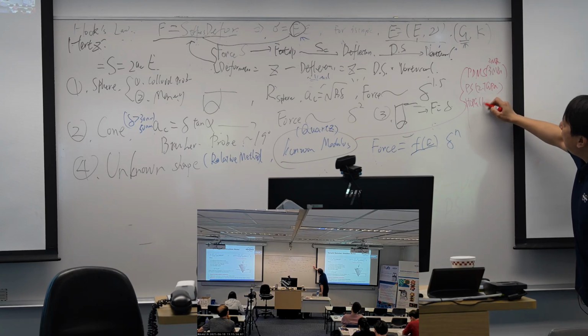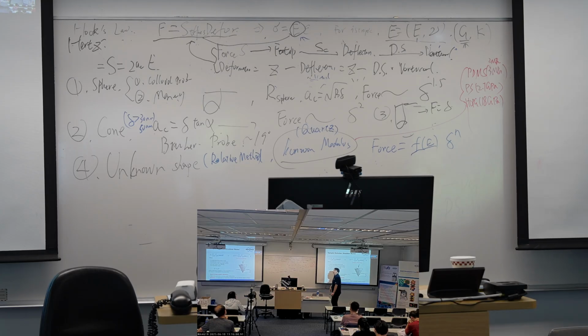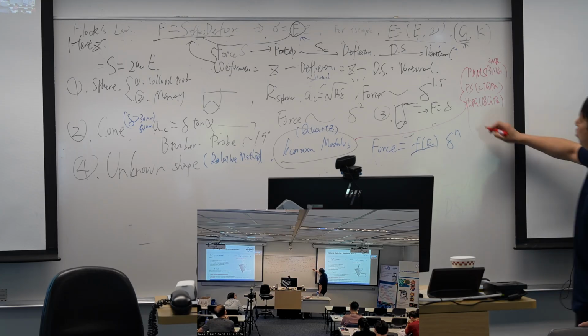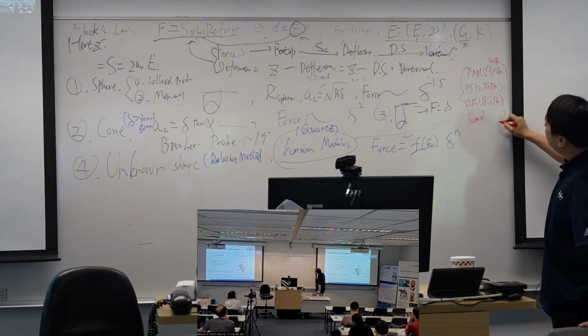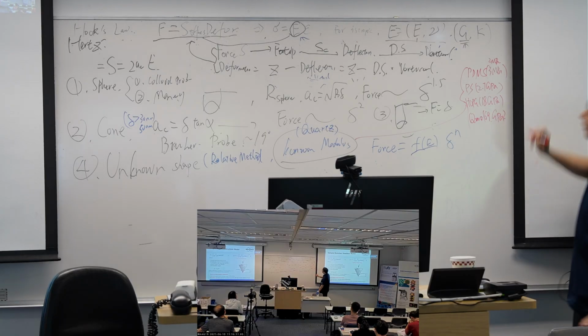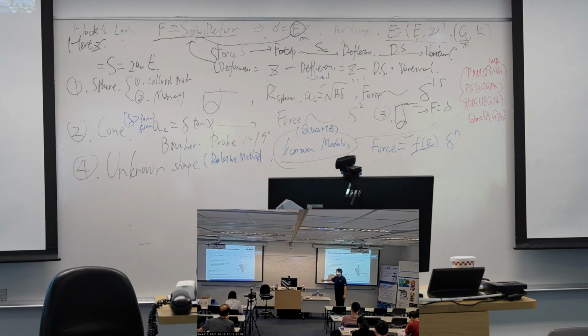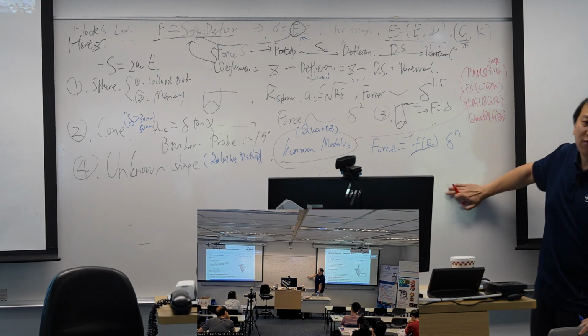It's about 18 gigapascals. And of course, the next one is quartz, which is 69 gigapascals. So we provided these 4 samples as a reference.